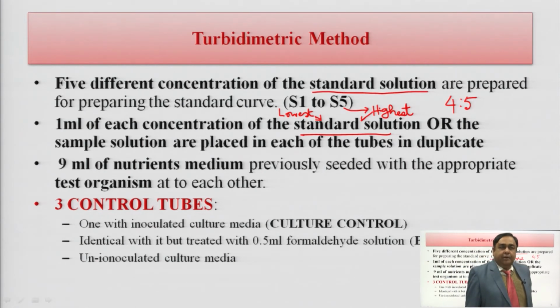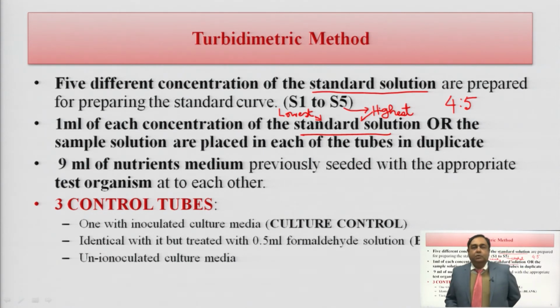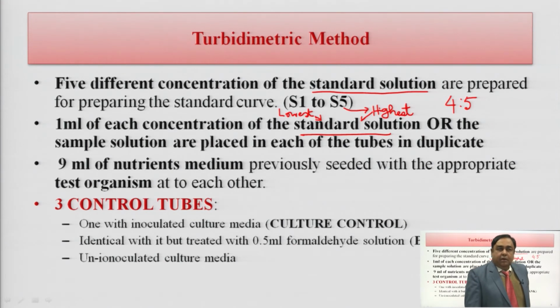Now, you take the sample solution whose concentration is unknown to you, the sample solution whose concentration you want to measure.